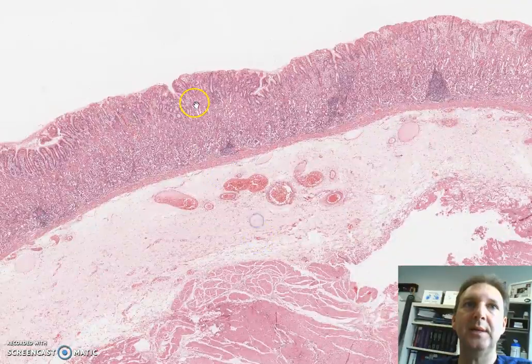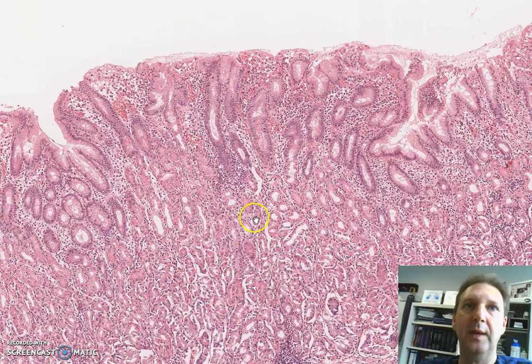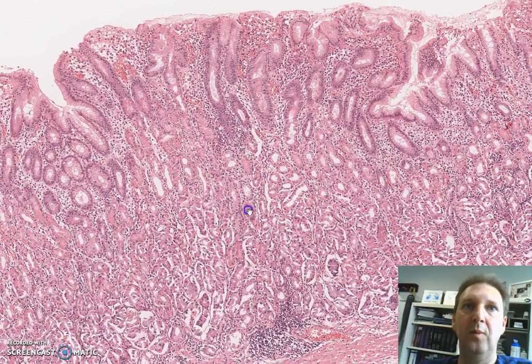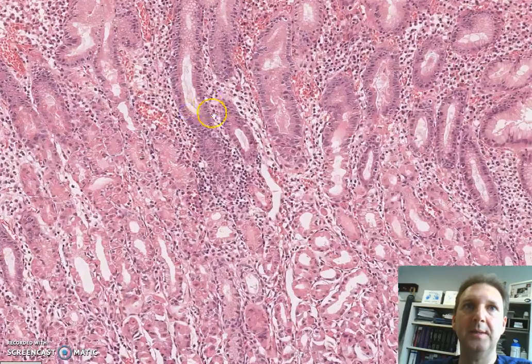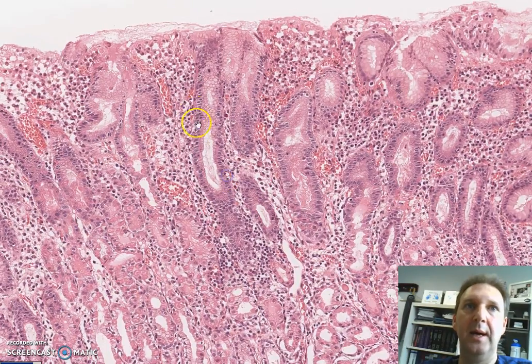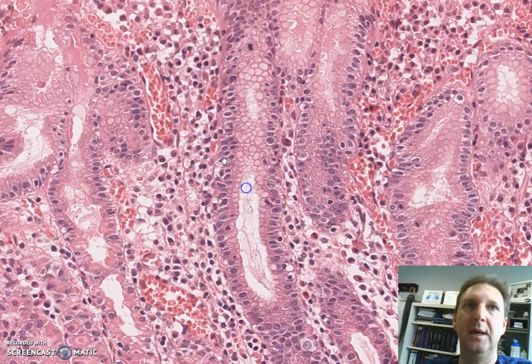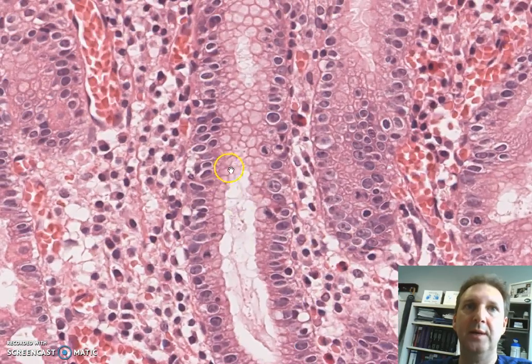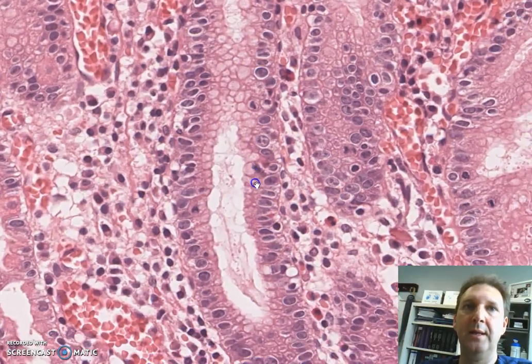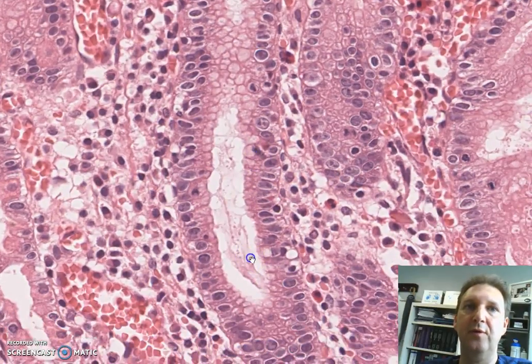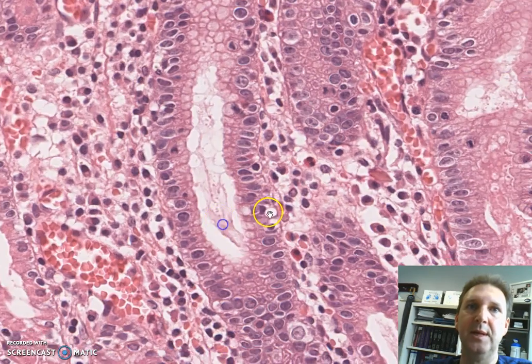Let's take a closer look at the mucosa. We can see the gastric pits with the crypts right underneath. The gastric pits are lined by mucous cells. These mucous cells secrete bicarbonate and buffer mucin. You can see right there the mucin inside.